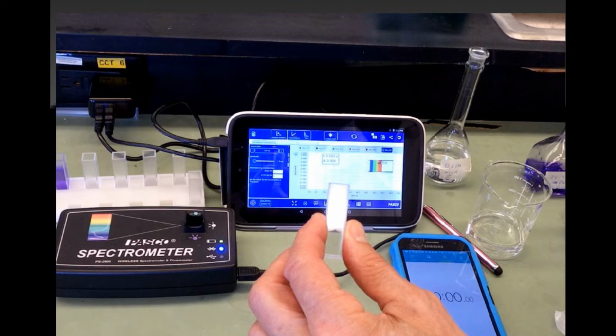mark on the timer. So it does take 5 to 7 or 8 seconds to mix the solution and get it in the spectrophotometer. I waited to the 10-second mark to start the record button on the instrument. And the reason I did that is it's an easy number, 10 seconds. I can easily add that to all my time readings later on when I want to interpret the values.